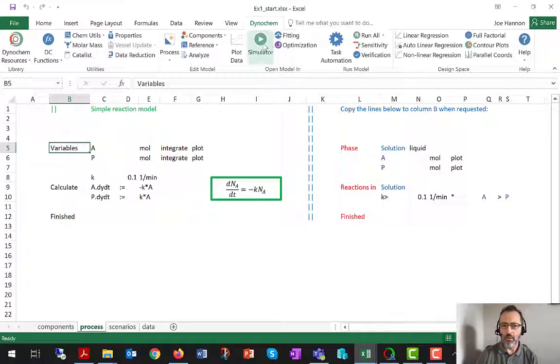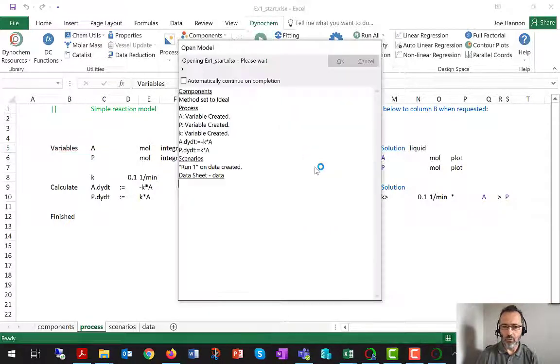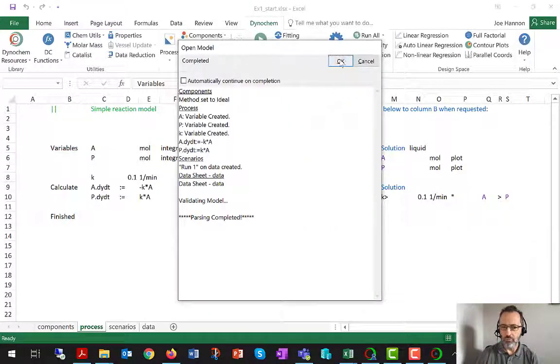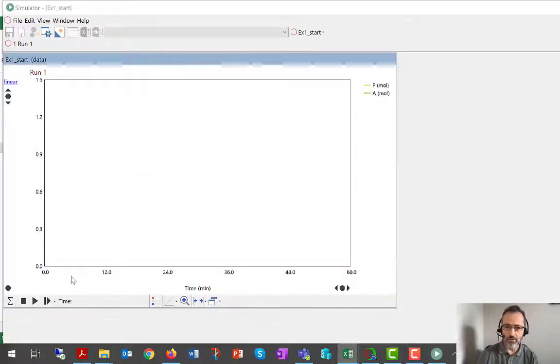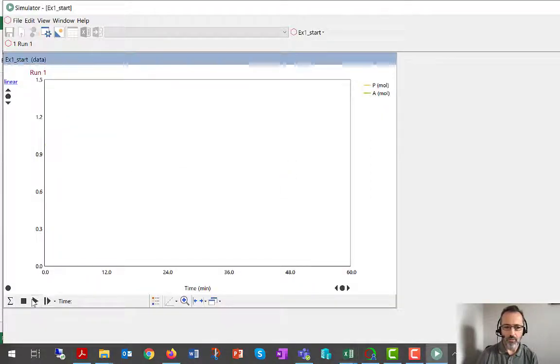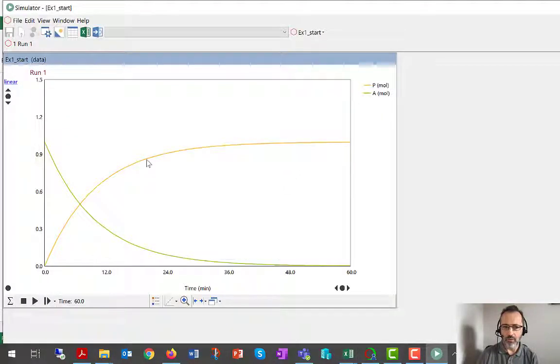Then to run the model, it's exactly like before. You would run, of course, you can run in any of the screens, but to just repeat what we've done a good few times in this series, I'll run in simulator.